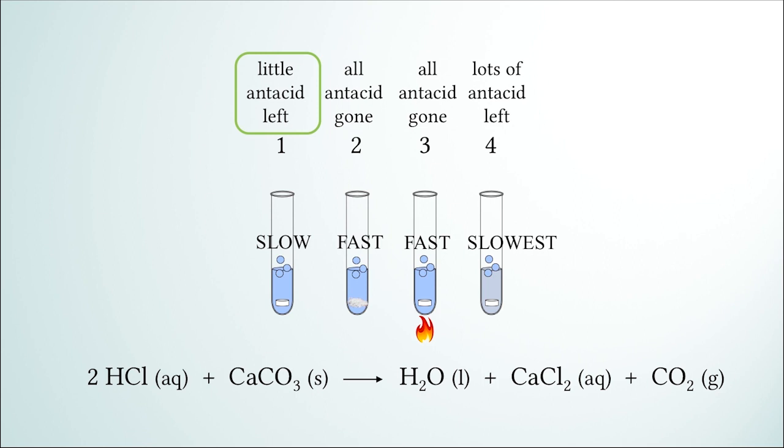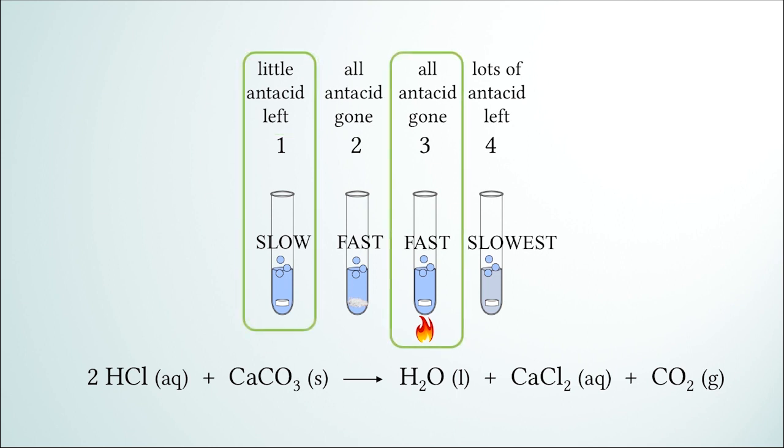So this experiment helped us to see the relative rates of the chemical reactions under different conditions, and we can make some conclusions from that. Looking at test tube 1 and test tube 3, the only difference between them was temperature.